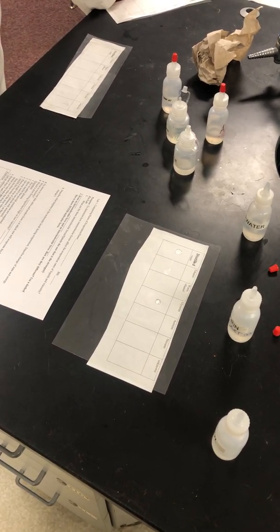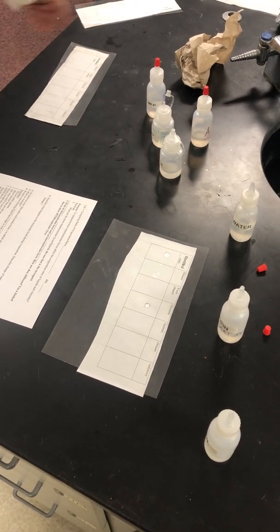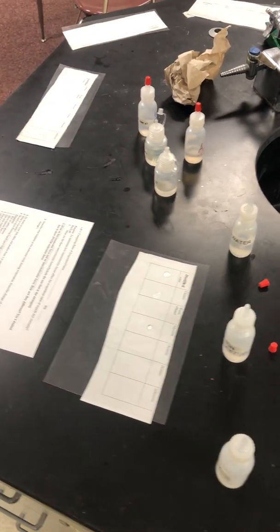And so as we wait for the drops to evaporate, we should have set the timer. Remember, there's a max time of 5 minutes here. Of course, you'll have a timer on the video, I guess.